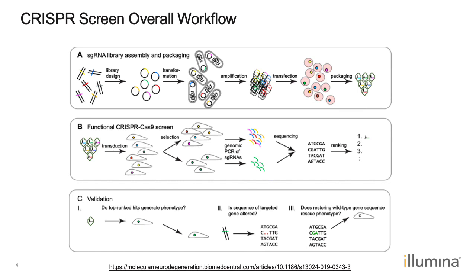In other words, we are just PCR amplifying the guide sequences contained in each cell and quantifying which guides are left over in our sequencing data after that selection, and then we rank them.